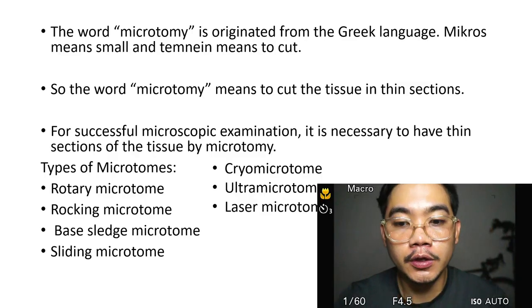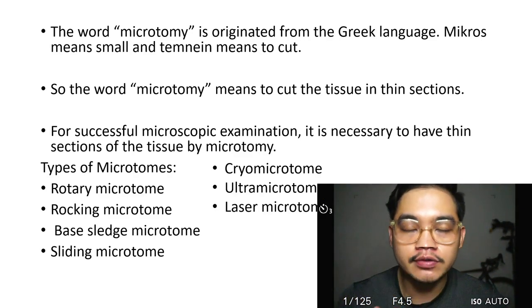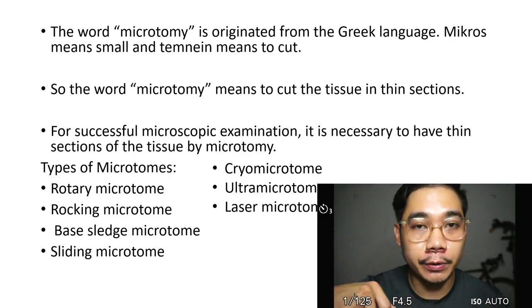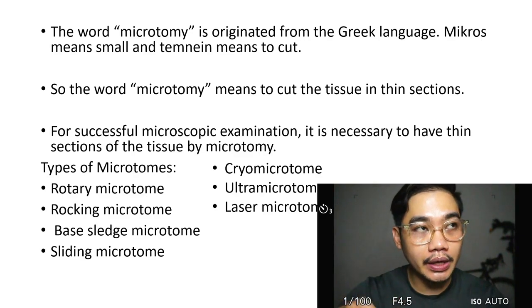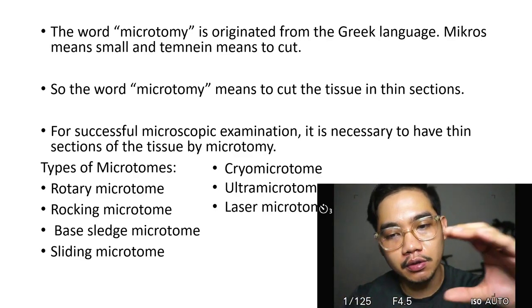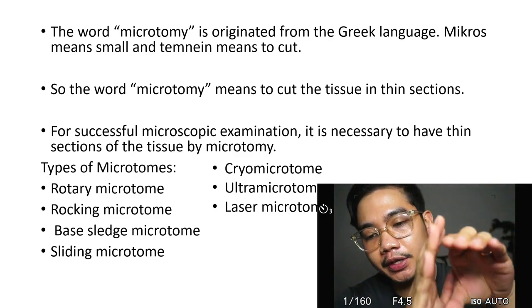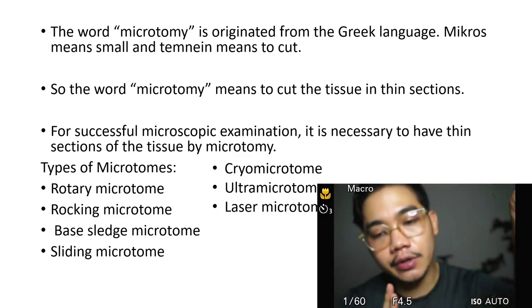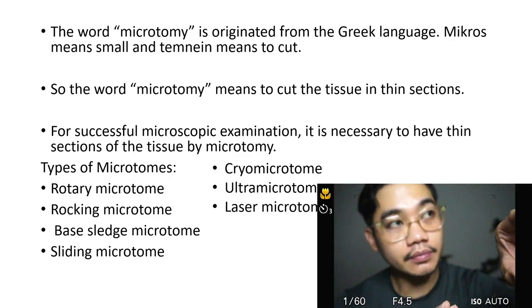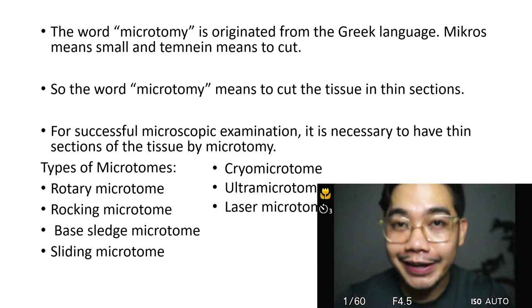So, that was Sir Jude, my medtech, and he was cutting the specimen. He was doing microtomy, and as you can see, there was a rotating flywheel, and the rotation of the flywheel causes the block to move up and down, forcing the specimen impregnated with the wax in the block to encounter the blade below. And when it encounters the blade, a small part of it is filleted.